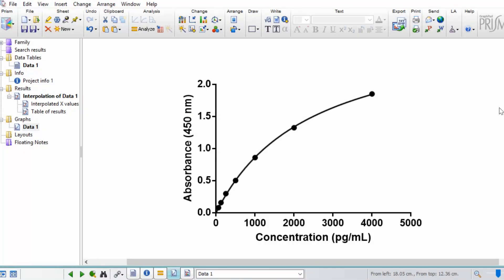In this tutorial, I'm going to show you how to use GraphPad to interpolate a standard curve by using an example of an ELISA assay.